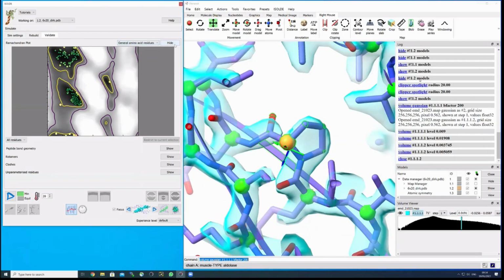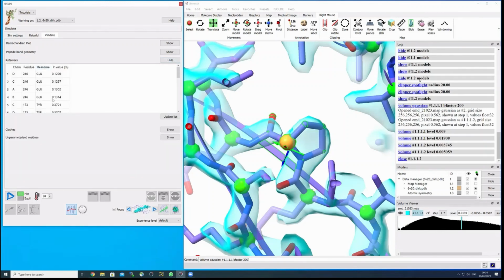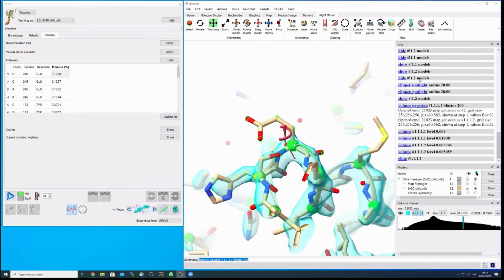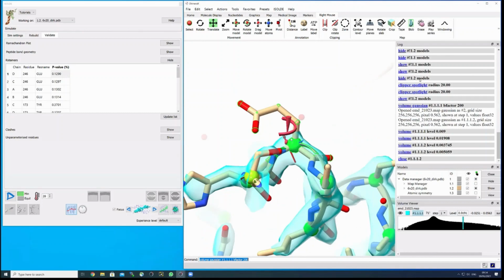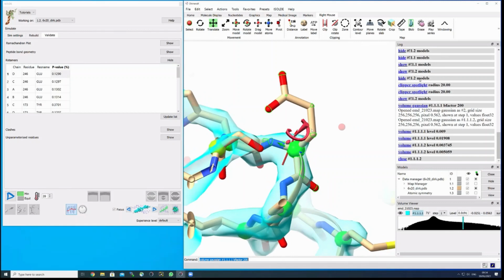Which brings me to the second tab here. So we can hide the Ramachandran plot and we can go to Rotamers directly. And if you open this, you will see a list of Rotamer outliers. And if you click on the first one, again, you will be sent to this position in the structure. And you see this now with this mark that this glutamic acid is an outlier, which means that the configuration of the sidechain with these angles is highly unlikely, and it is basically not being seen in the high resolution structures. So you should think about taking care of this.